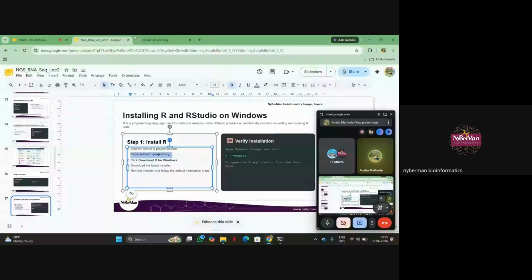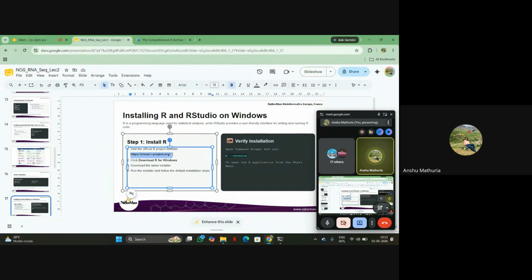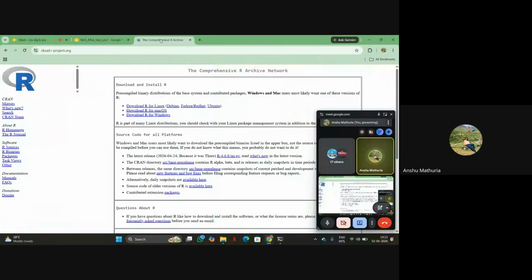Thank you. So for our installation, I have mentioned a website here, that is the Cloud R project. So you copy this website, you directly go and put it in the browser. This particular web page will open.